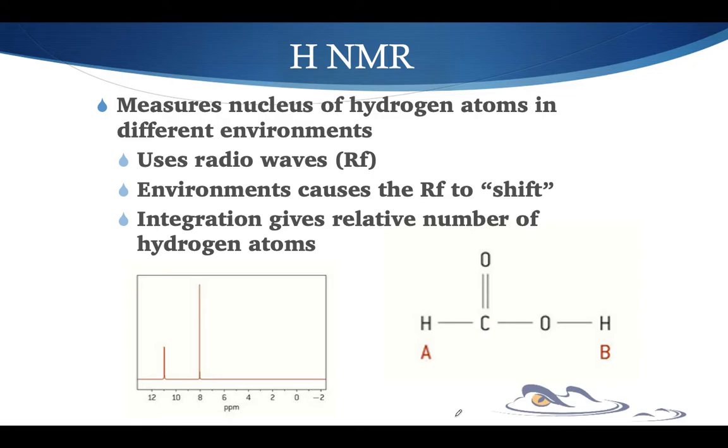And so when they find certain resonations of these hydrogens, then it causes an absorption, if you will. Very similar to if we could see the colors, it'd be very similar to us seeing the different colors that are absorbed. And with this, it's a radio wave, so we can't really see the colors that are being absorbed, but it's basically the same idea.